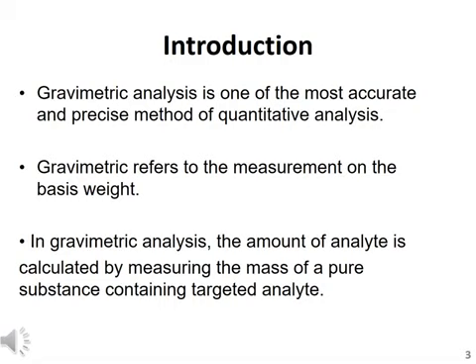A unique compound of known measurement can then be used to determine the same analyte's mass in the mixture, as long as the relative quantities of the other constituents are known. There are four main types of methods of this analysis: precipitation, volatilization, electroanalytical, or thermogravimetric analysis.